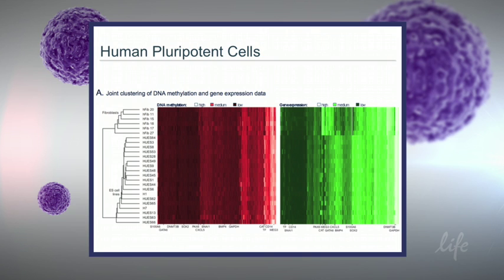And in our own experiments, when we differentiate different cell lines into endoderm and quantify it using CD184, which is a surface marker for the early endoderm, again, you can probably not read these different cell lines here, but between the same cell lines, in many cases, we see consistent efficiencies, but quite different from other cell lines. And so, again, the goal is to try to get a bit more into why we observe these differences.